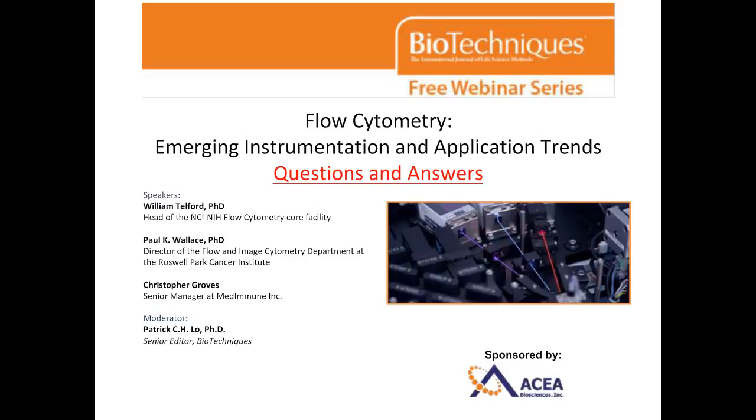Great, thanks. Our next question is for Bill. How does the reuse PMT technology compare to other flow cytometers in respect to electronic aborts? If I understand the approach correctly, event B must not enter the first laser before object A passed by the last laser. Does that matter, or is the time needed to generate a baseline longer than the time it takes to pass all three lasers anyway?